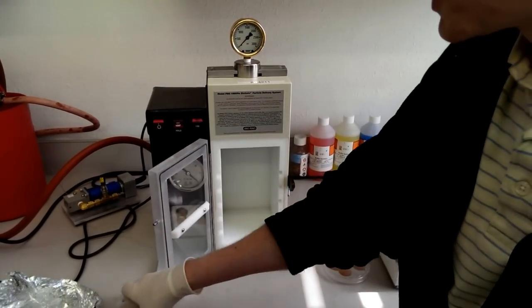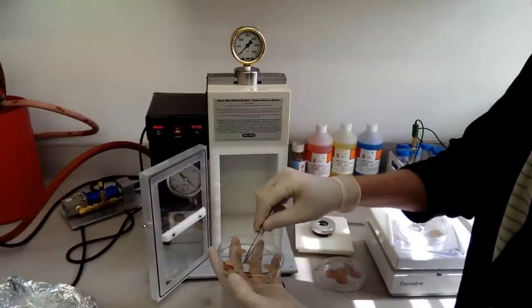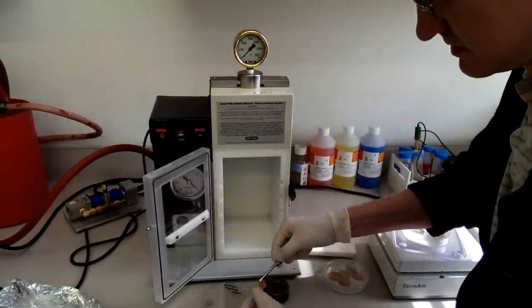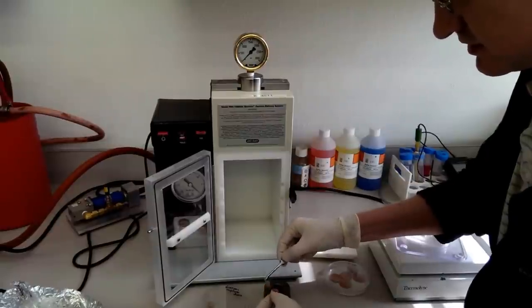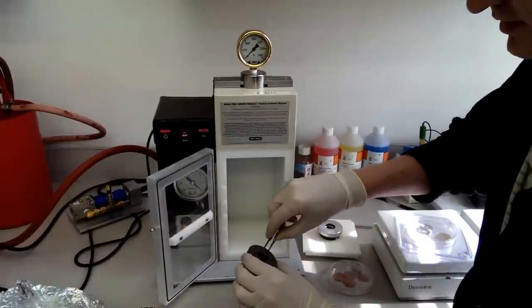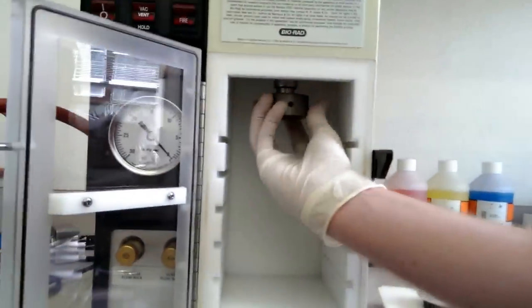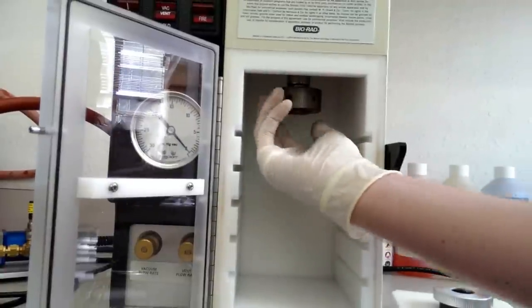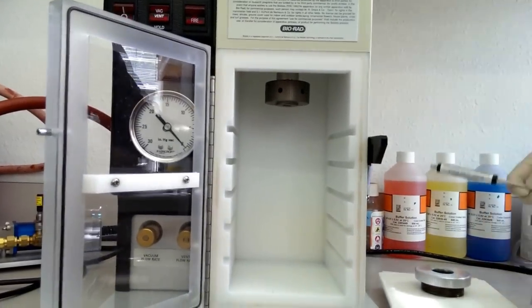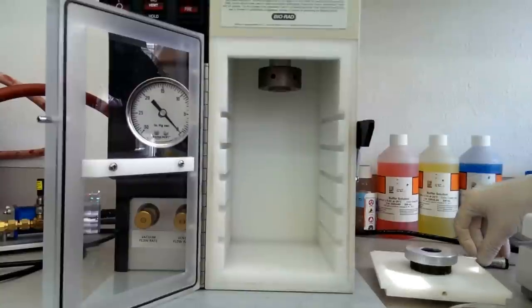So first, you need to put in the rupture disk. So that's what these little plastic pieces here are. These are 650 rupture disks, which means that they will break at 650 PSI. Put that in here, like that. And then there's a little thing up here that you screw that into. And it makes some fun noise, so bear with me. Cool. And then we've got this little tool here to tighten it up a little bit. All right, so that's all nice and secure.